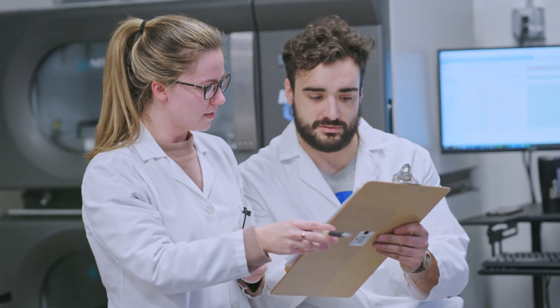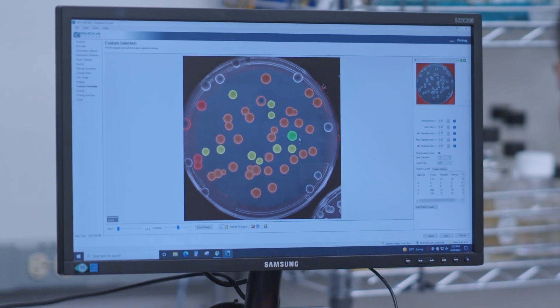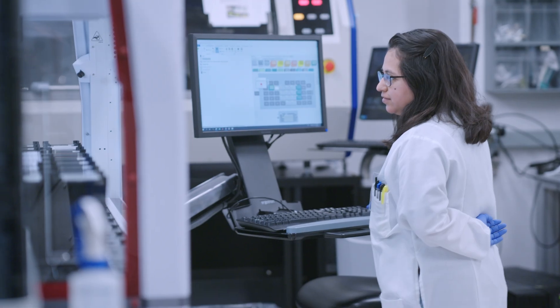BenchLink is one solution where there's a lot of different modules that come together. It has great connectivity, so if I click on a strain, I can see all the related items that are on that strain.